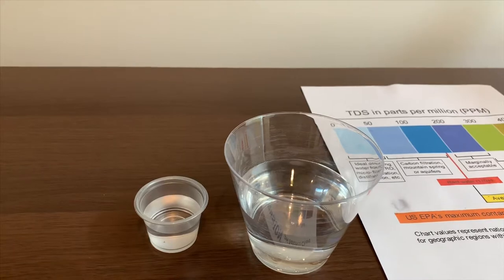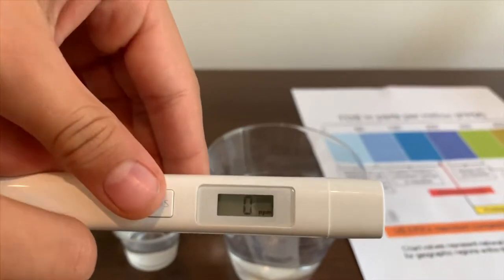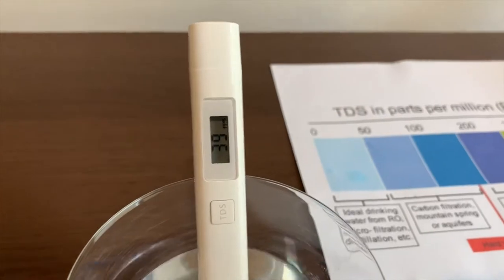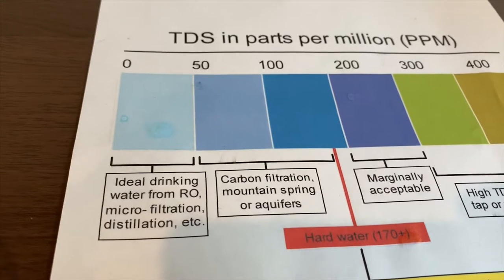Let's test the TDS level first. Turn on the TDS tester. Make sure it says 0. Let's put it in the water. 39. That is an ideal drinking water.